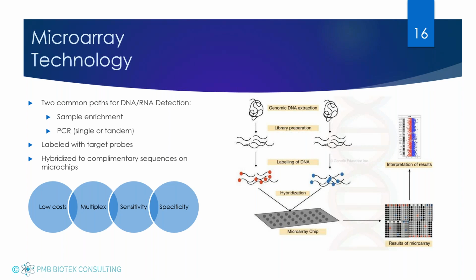They're highly sensitive and highly specific because it's the same process that we're looking for in PCR, where we have a known set of DNA primers that we're looking for. You can sometimes see cross-reactivity as we try to multiplex these out, and the actual hands-on time for these tends to be a little bit more in depth, although some automation can reduce that.